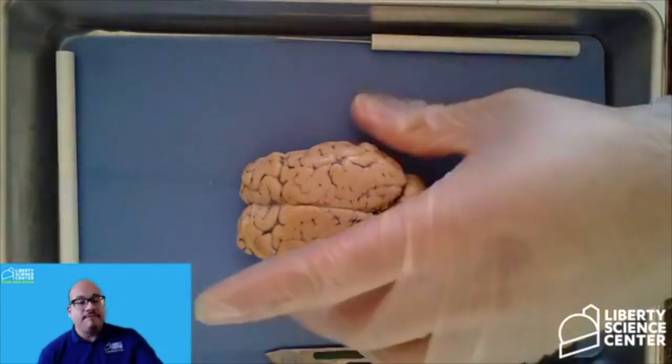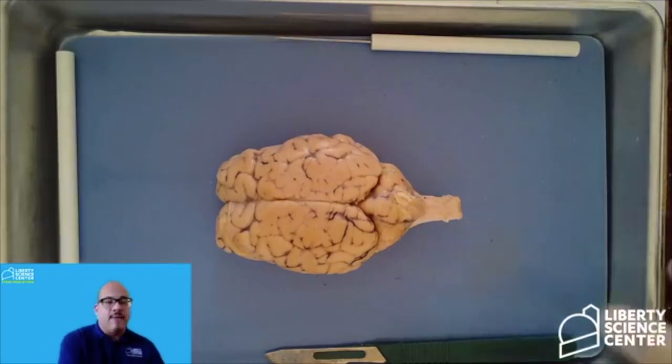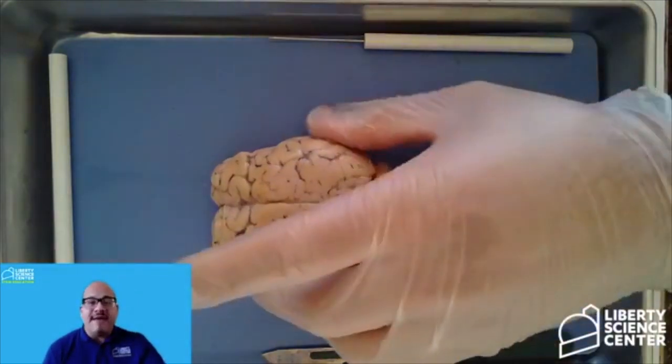Here we have, as I mentioned before, our sheep brain. This is the external anatomy of this organ. As I mentioned before, we definitely use dissections to learn more about anatomy. If you remember from my cow eye dissection and the few rounds of dissections that we were doing, this is all pertaining to comparative anatomy.